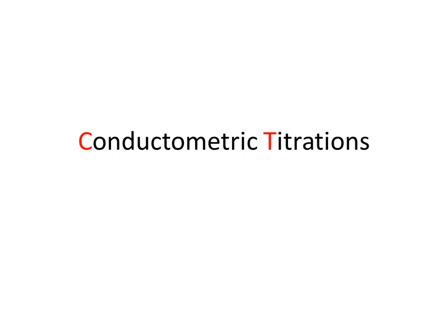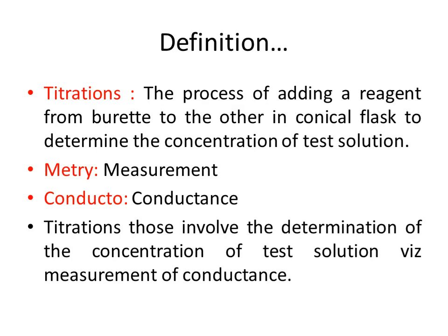In this video, we will be discussing conductometric titrations. So what exactly does titration mean? Already we discussed, just a recapitulation: the process of adding a reagent from the burette to the other in the conical flask to find out the concentration of a given test solution.